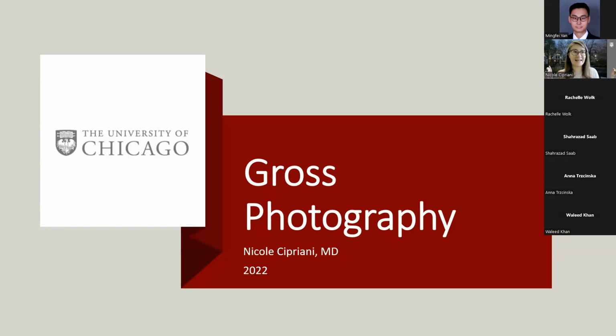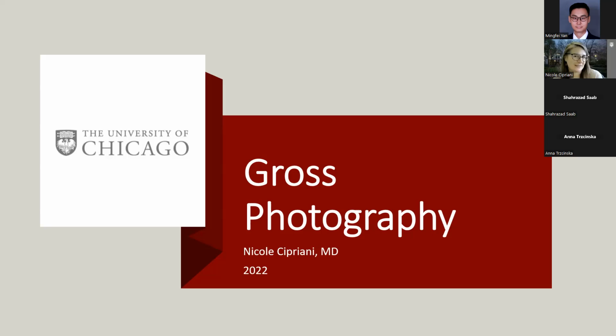that is so critical because the people that are signing out the cases, right, aren't always the ones that see and touch the specimen. And so to have a record of what it looked like, what you did, I think for everyone involved in this patient care process, it's really, really important to have good documentation of those gross findings. And especially in the head and neck, when a lot of it is squamous cell carcinomas, gross staging is extremely, extremely important. And so having good documentation of the gross, I think, is critical.